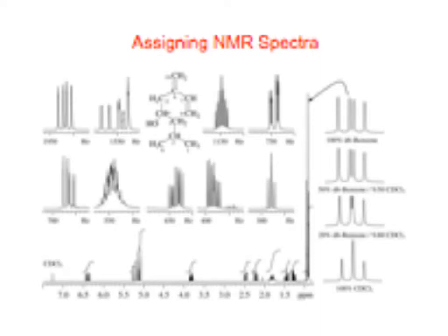No, I don't think any of those reasons explain why it affects one of the methyl groups differently than the other. It affects both the same, but when it's on one side, it's different than the other side, so you have to account for those. Yeah, but why is that? Why is it different on one side than the other side? Because the shielding of the proximity to the OH group is going to be different than the shielding in the proximity to the CH2 group.